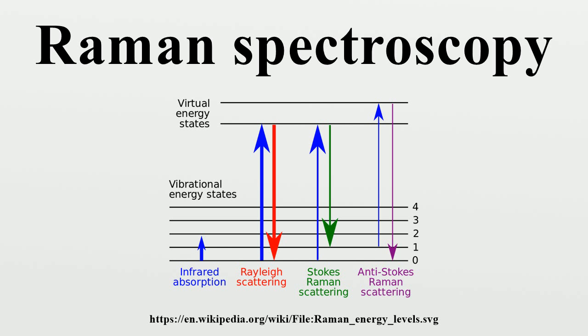Raman shift. Raman shifts are typically reported in wave numbers, which have units of inverse length, as this value is directly related to energy. In order to convert between spectral wavelength and wave numbers of shift in the Raman spectrum, the following formula can be used. Where Δν̃ is the Raman shift expressed in wave number, λ0 is the excitation wavelength, and λ1 is the Raman spectrum wavelength.